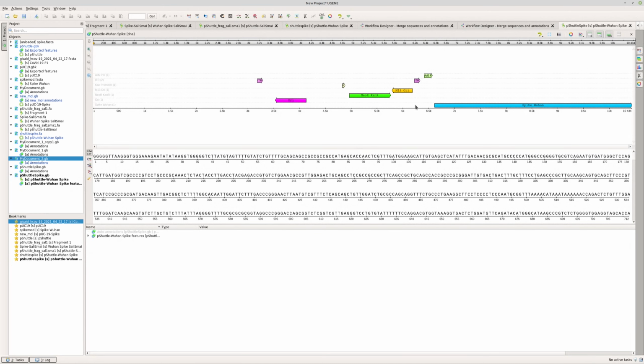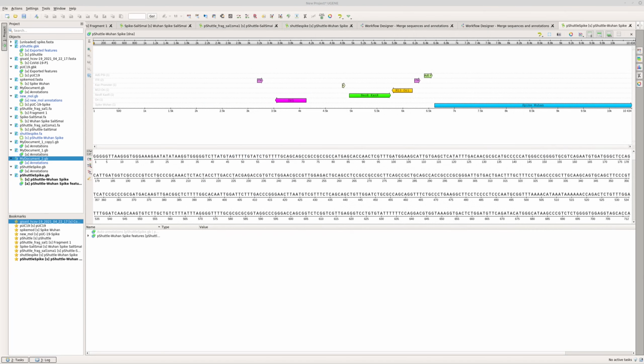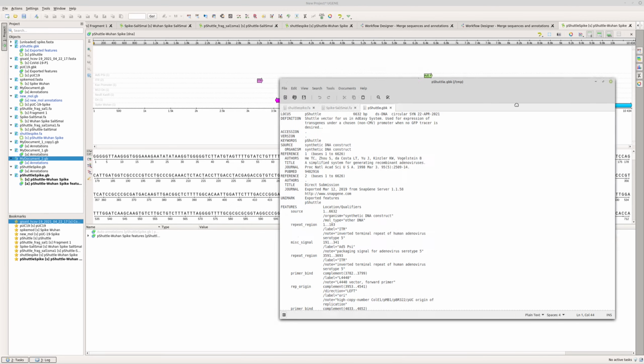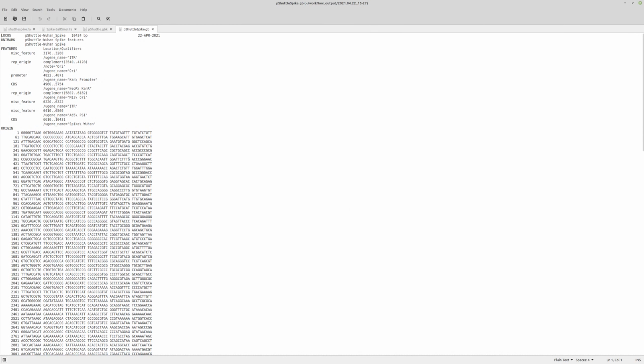And one thing that it did not do properly is it is not a circle. Now, one thing that we can do subsequently is actually edit that fairly simply. So here we're going to go to this, and basically we're going to open up that file. Just let me find it. Ooh, that's dangerous. Right now I opened up this one, and all I see is this. So that's not the right one, which is good, right? It's actually in my home directory. So let me open up the correct one. And once I open up the correct one, it'll make more sense. It's my workflow outputs. And here it is, right? So this makes more sense. This is the correct file.